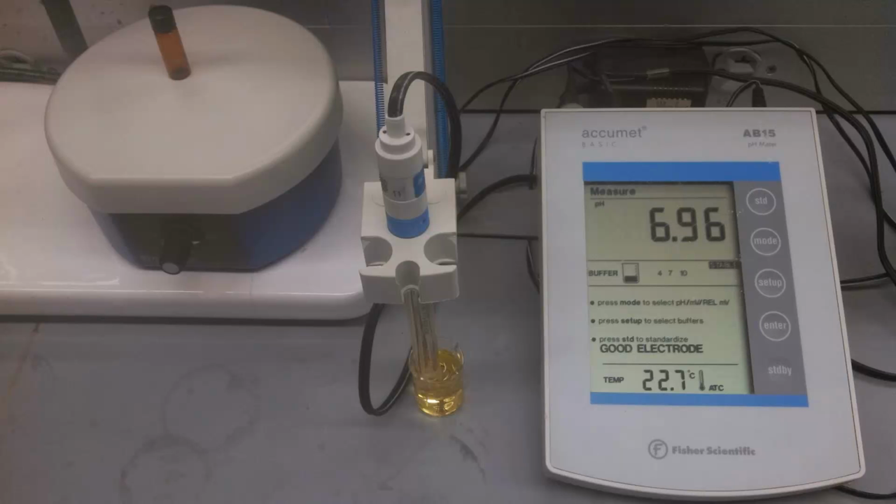When you show up to lab, this is what's going to be on your bench. There will be a pH meter with an electrode that's resting in a buffer solution, and then you'll also have a stir plate with a very tiny stir bar on it. When you turn your pH meter on by pressing the standby button, what you need to look for are the words "good electrode" on the screen. This means that the electrode is standardized and it's ready to use.